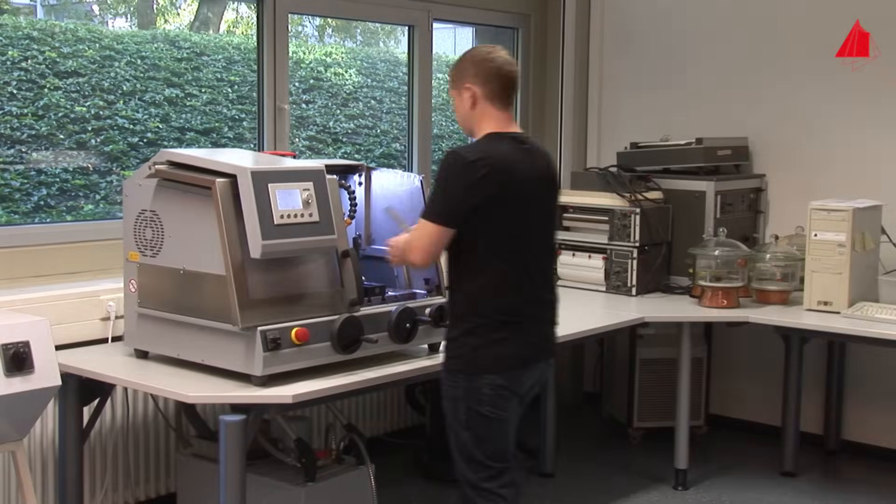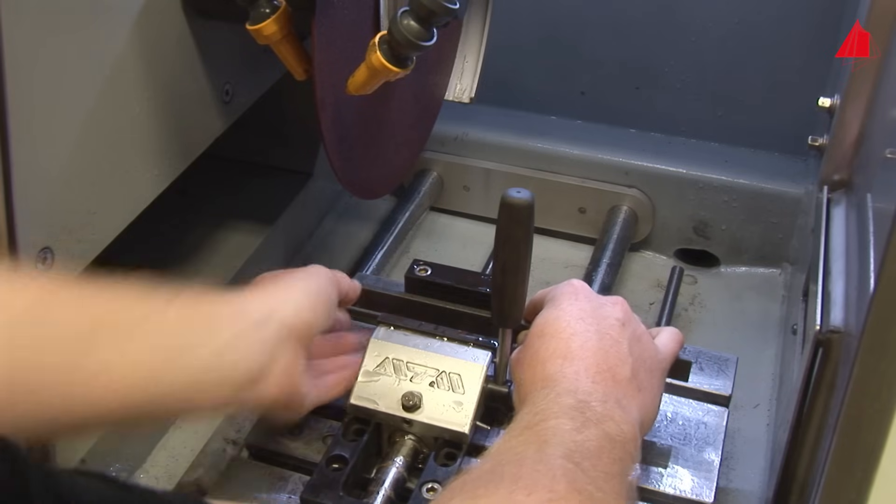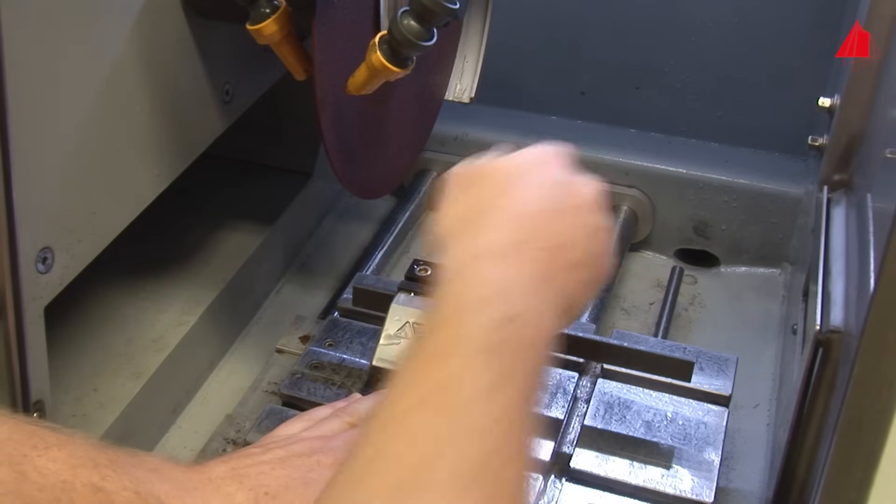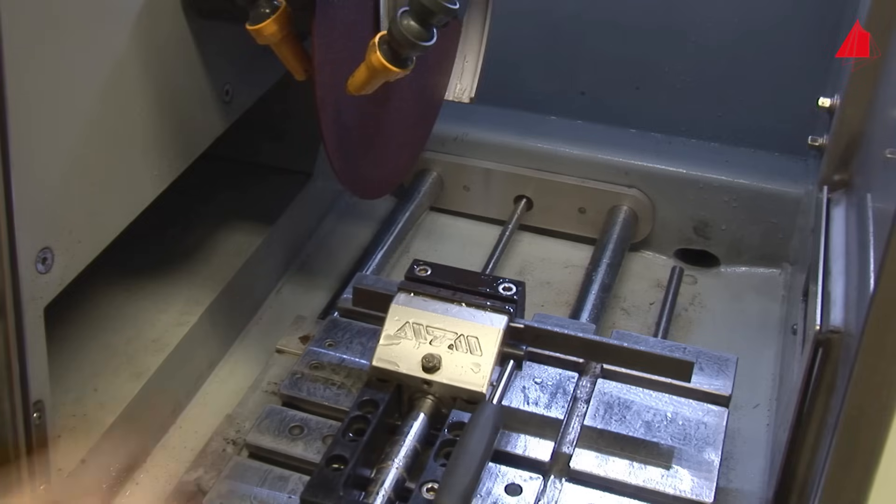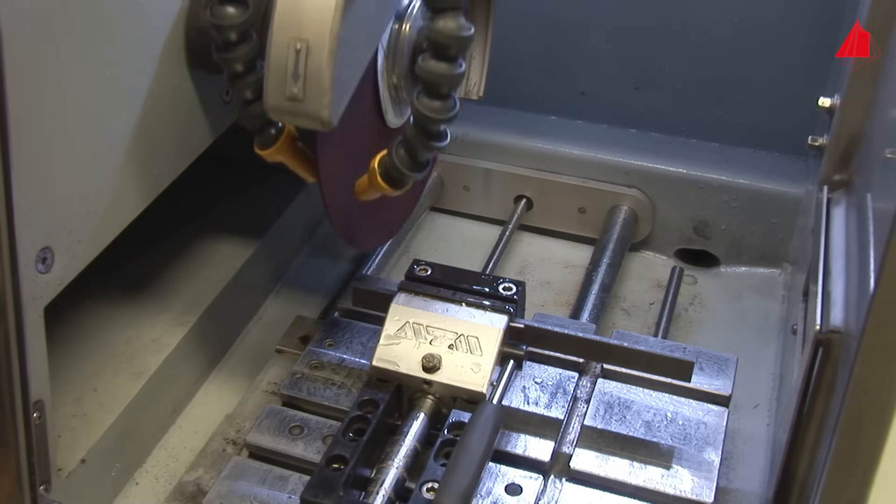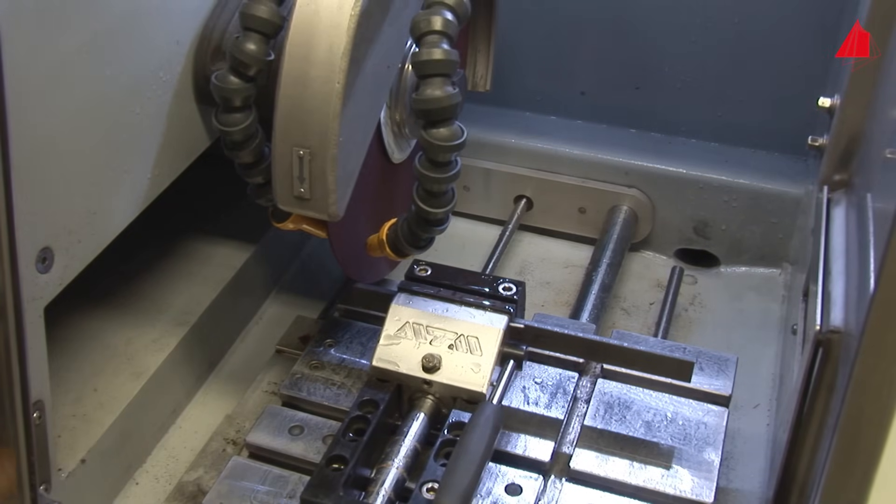Then, he takes the bar to the abrasive saw to cut out a small sample. He fixes the bar securely, prepares the machine, selects the cutting parameters and starts the first abrasive cut.